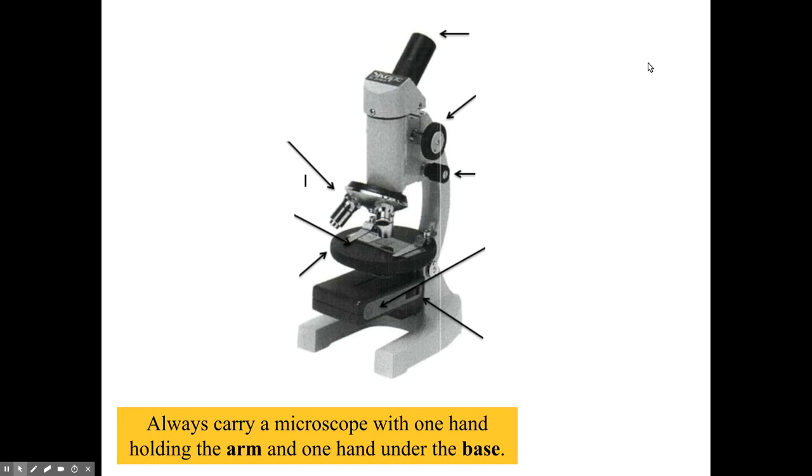Just quickly going over the different parts of the microscope. This first one is the eyepiece. The eyepiece is what contains the ocular lens. It's where you look into the microscope.